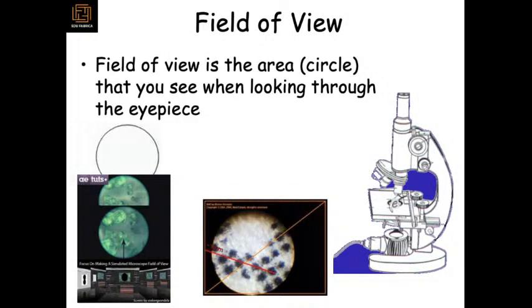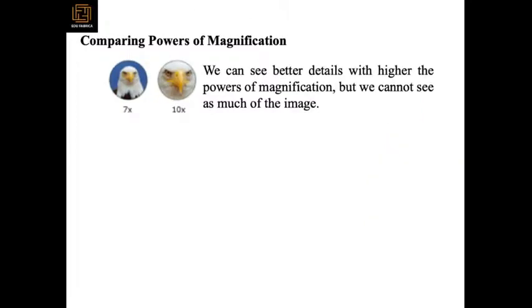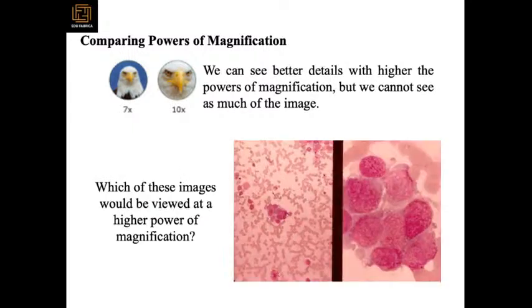In the field of view, whatever you are seeing, you're seeing upside down and also opposite. That's not straight. And you can have magnification from 7x to 10x as per your objective lens. An image of a teratoma, some carcinoma cell lines look like this, and at higher magnifications you can go up like that.